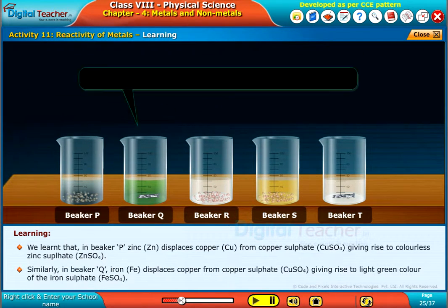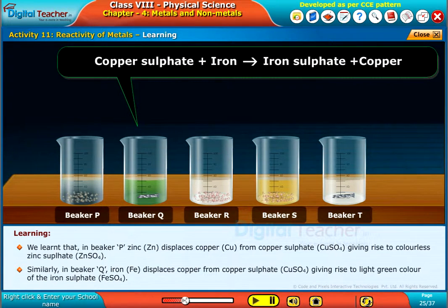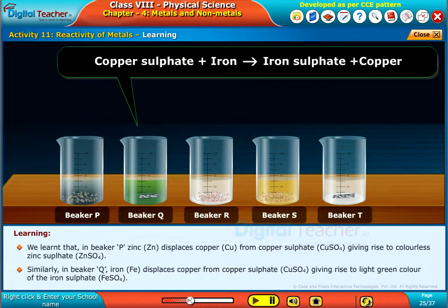Similarly, in beaker Q, iron (Fe) displaces copper from copper sulphate (CuSO4), giving rise to the light green colour of iron sulphate (FeSO4).